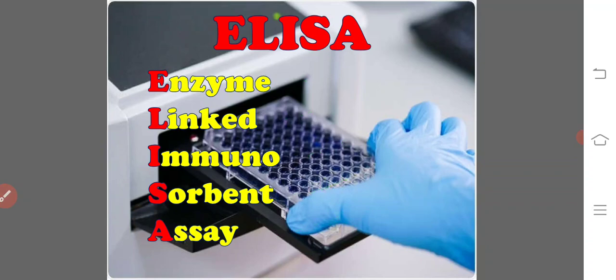ELISA is a popular format of wet lab type analytic biochemistry assay that uses a solid phase enzyme immune assay to detect the presence of a substance, usually an antigen, in a liquid sample or wet sample.